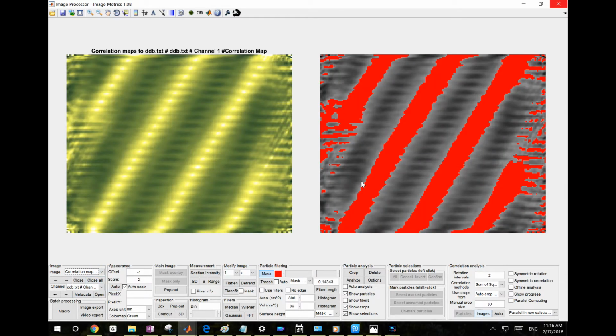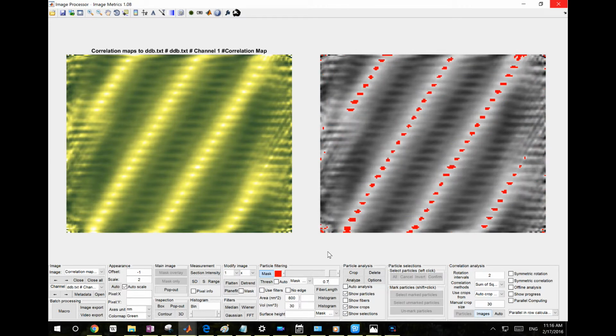You see that this is the correlation map because we use 0.7. You can specify the mask threshold as 0.7 just to see better which ones are matched. Right now you see those isolated mask areas, they are the matches, and apparently we have a lot of matches there, almost every individual cell matches, and that's the pattern showing up in this original image here as well.